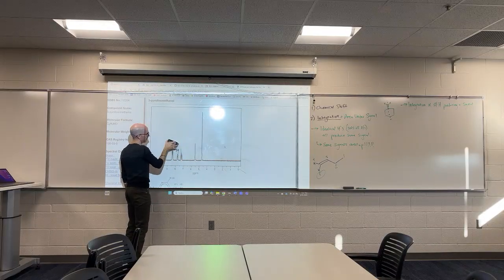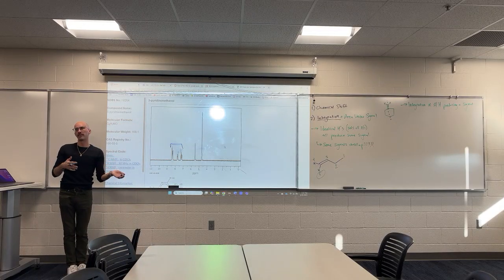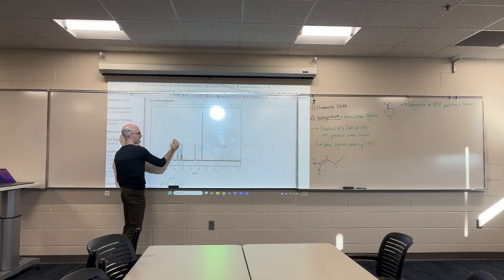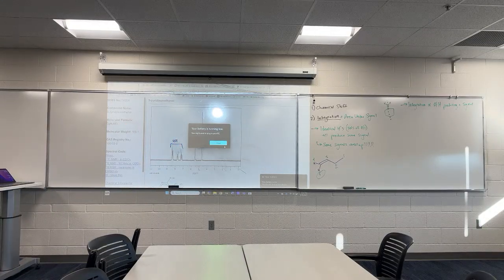Actually, I don't really do this. I take the entire aromatic region and I integrate it at once, because I'm not going to have you decide what signal comes from what. I would rather you actually think of the aromatic region as just one region of signals. This integrates to 4. Oops. Right at the good part.